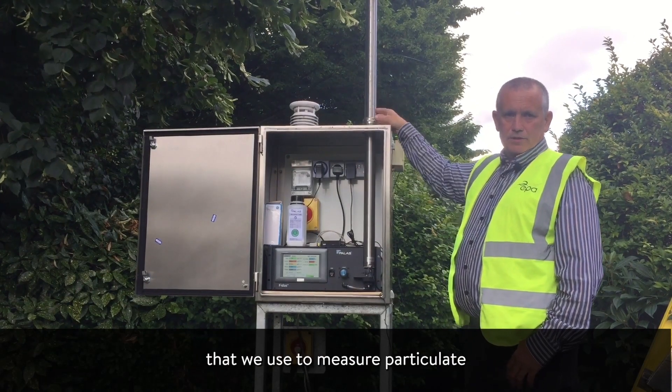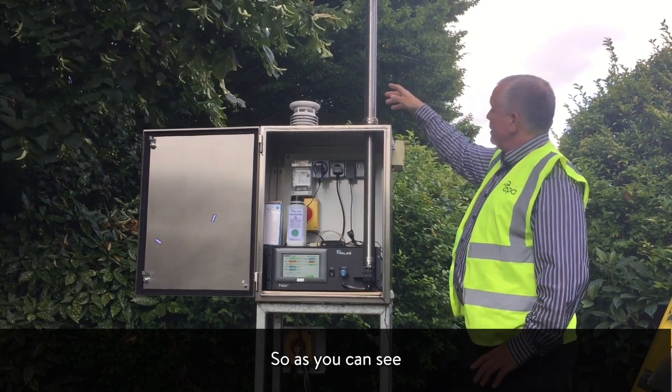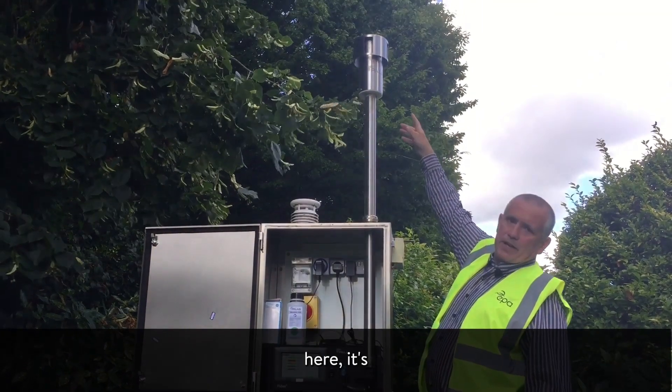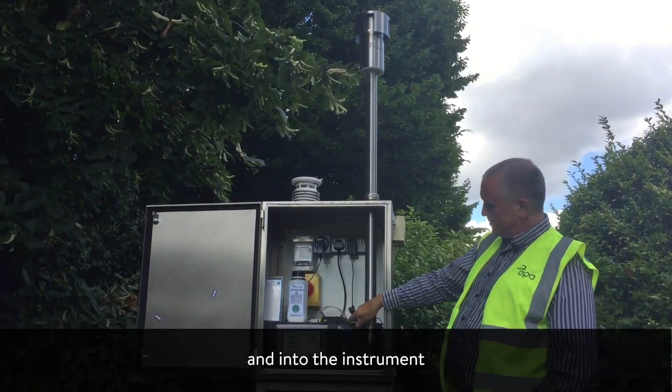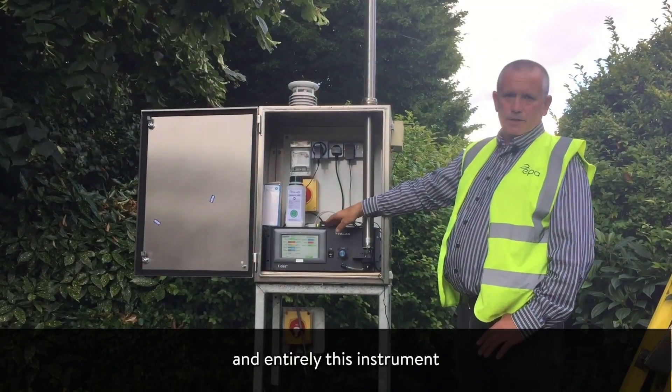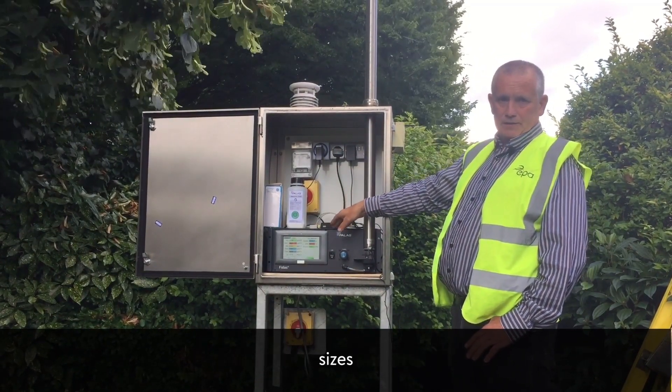This here is a FIDAS that we use to measure particulate matter or fine dust particles in the air. As you can see, the air is taken in through this head and into the instrument, and internally it will break down the particulate matter to its relevant sizes.